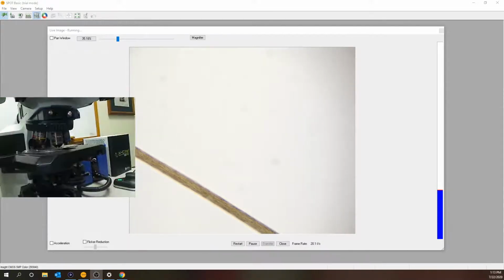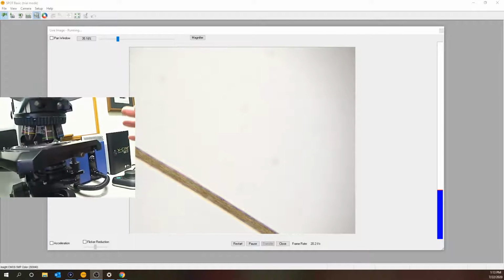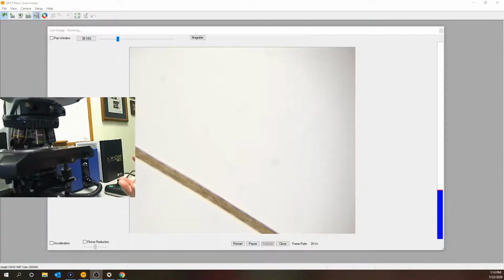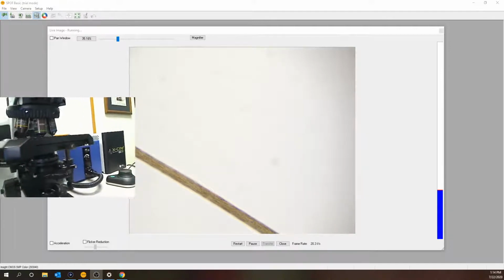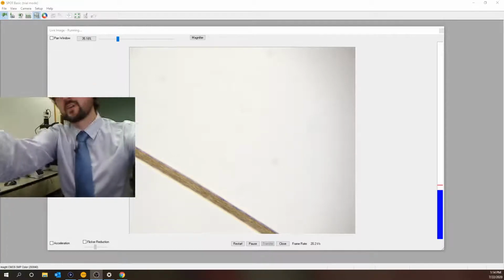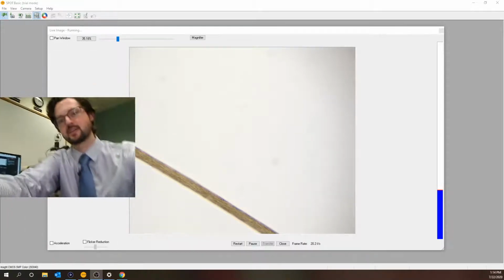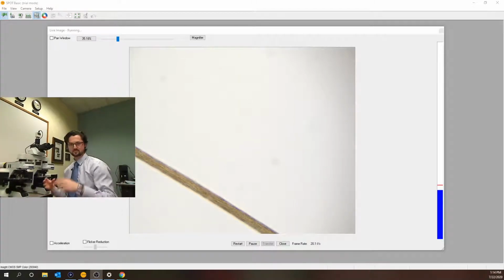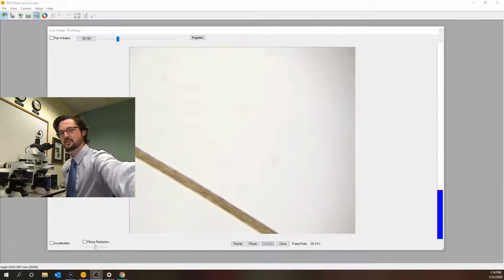So something that's kind of interesting is with high resolution or high numerical aperture lenses, you can resolve all the detail in the world. You could see very fine details, the fine striations. For example, in this hair example, you can see all of those little pigments that are included. You can resolve them.